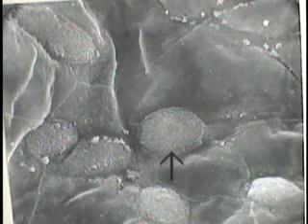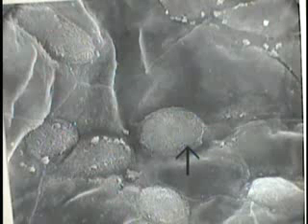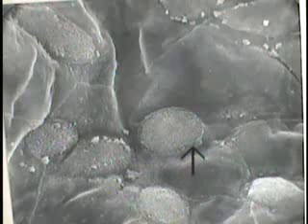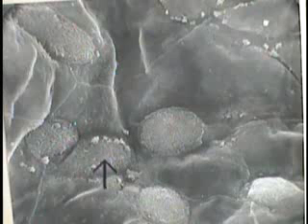These round appearing cells that have that fine microvillus appearance to the top, these are the apices of type 2 alveolocytes, those cells that secrete surfactant. Another one is shown here and is being crossed by the arrow. Another one is shown up here, and two at this location lying immediately adjacent to one another.